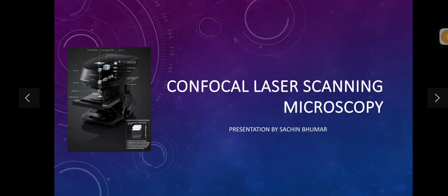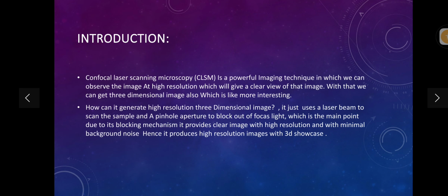from art. So let's start the subject of confocal laser scanning microscopy. Introduction. Confocal laser scanning microscopy is a powerful imaging technique in which we can get the image at a high resolution, which will give you a clear view of that image.